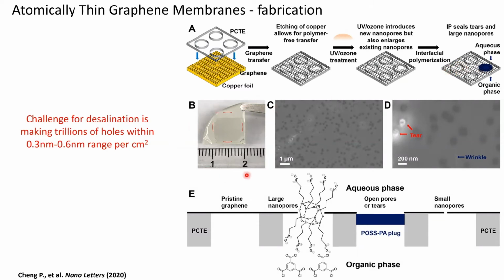This is what the optical image of one of these fabricated membranes looks like. An SEM image shows graphene covering vast regions of this polycarbonate track-etch membrane with these pores. You do see some damage in some open pores. I'll talk about how you seal them in a bit. A zoomed in image further shows you these clear, nice 200 nanometer pores covered with graphene.